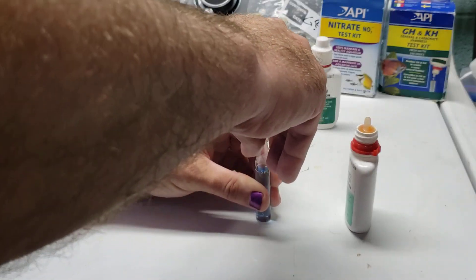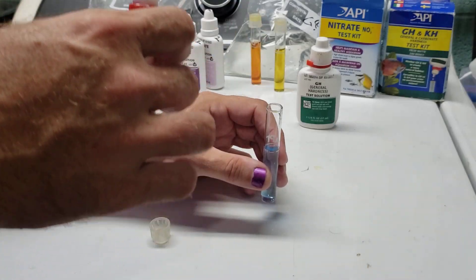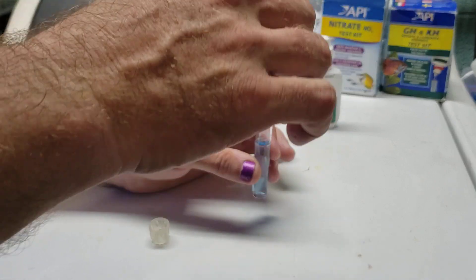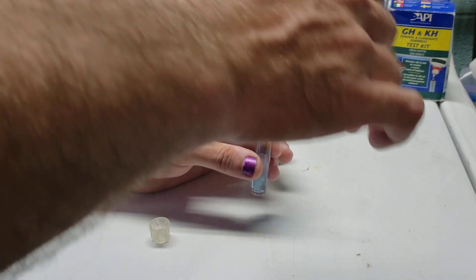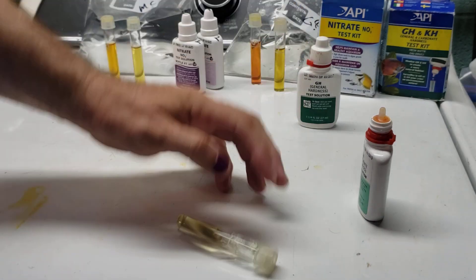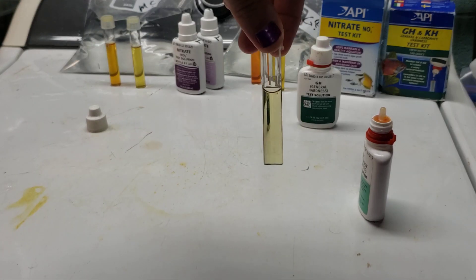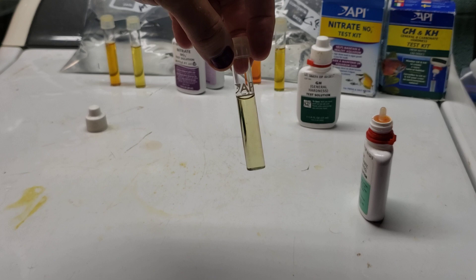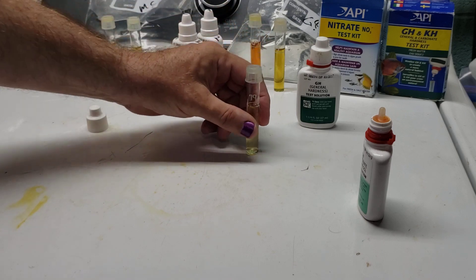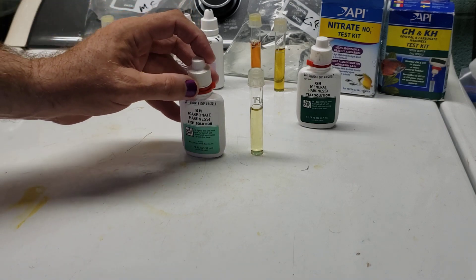Now you're going to add one drop at a time, and every time you put one drop in, you're going to keep track of that drop, put the lid on and shake it again. At some point we will get a change to yellow — I suspect it will be this drop. So you put the second drop in, invert it, and bang, just like that — it turns to yellow. So that would be two degrees. If you had to put four drops in before that color change happened, that would be four degrees. It's that simple.